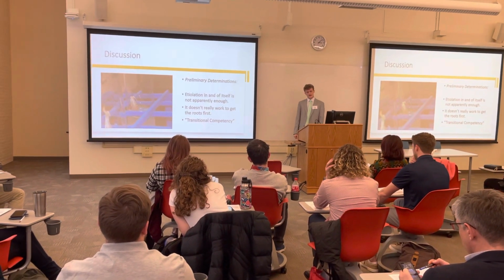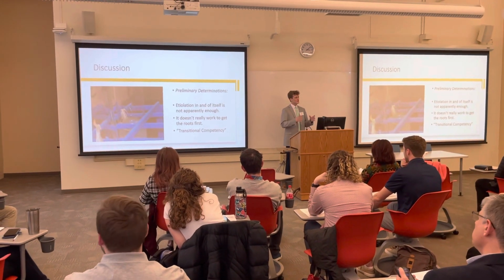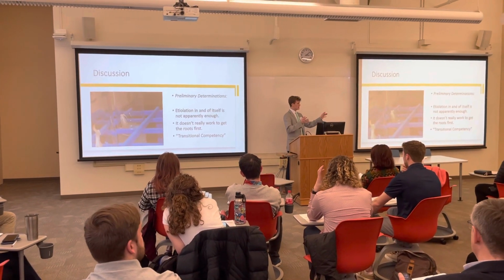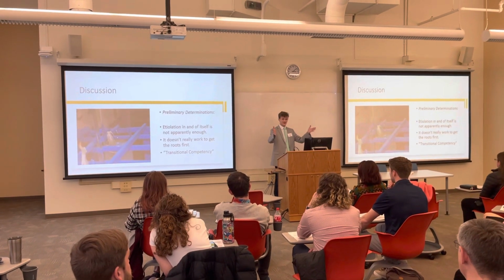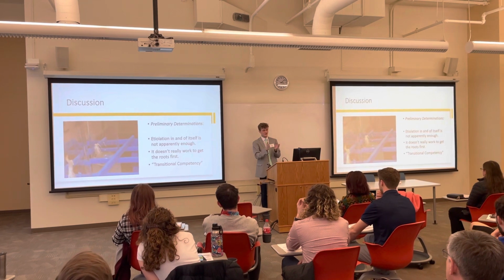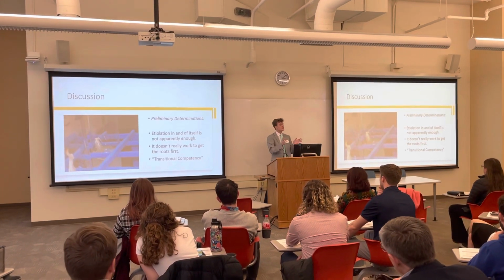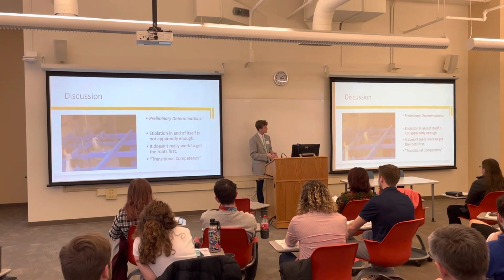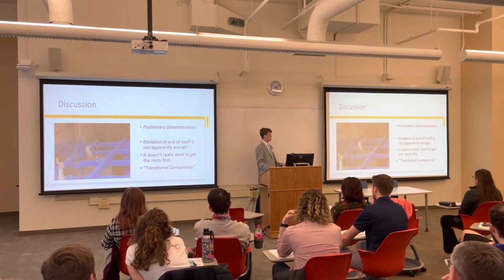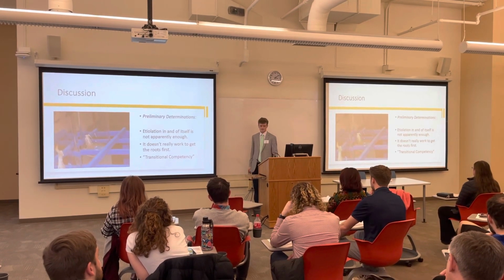Final thing that we recognize is this idea of transitional competency. If you look at the plants, the 3 age groups, some are too young, some are too old, and some are just right. This transitional competency puts them in that transitional period between forming the preformed flower buds and being juvenile plants. We think that's where they're most competent for callus tissue formation, and thus we think those are our best chance at using viable tissue.